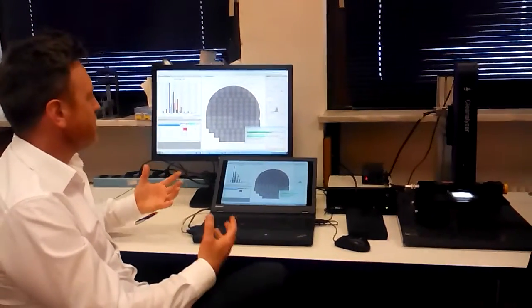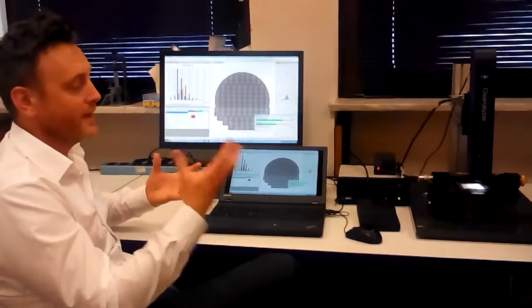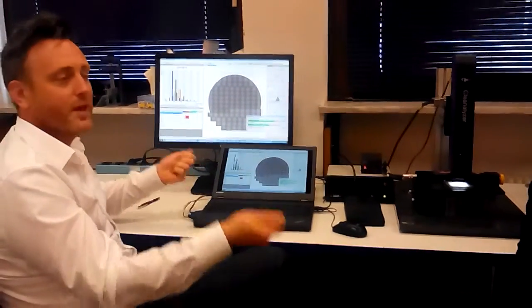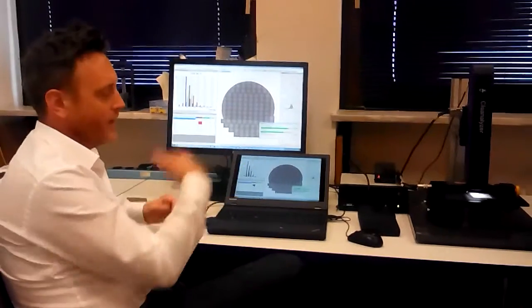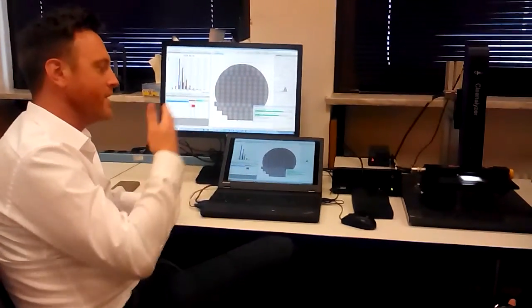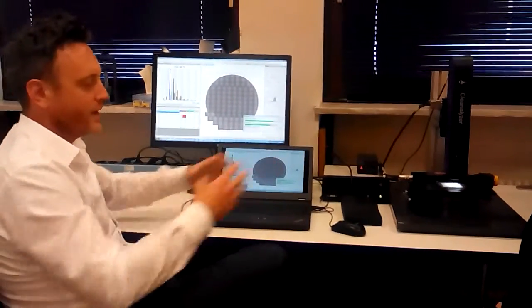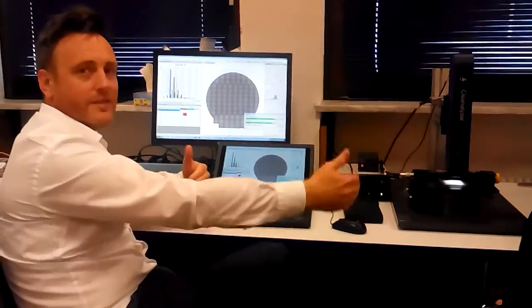So this has come from an object that was very dirty, and this would tell the user that he would need to take all that batch of samples and put them back through his cleaning procedure, rewash it, and then come back to this, and then keep on going. So it would provide an ongoing verification procedure for a manufacturer and a cleaning process to ensure that no dirty parts are delivered to a customer.